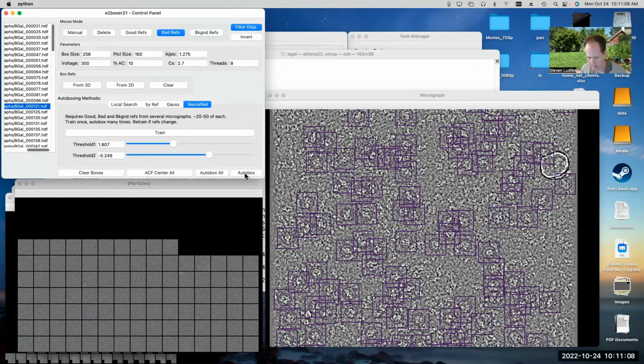I don't think I want to take the time to do it today. I probably would train the network a little bit better, given what we're seeing here, just to try and get the results a little bit more optimized. But for purposes of this tutorial, I think we'll be fine.